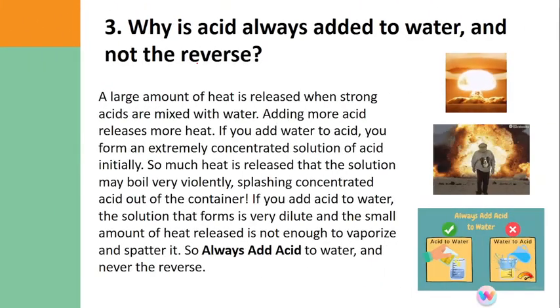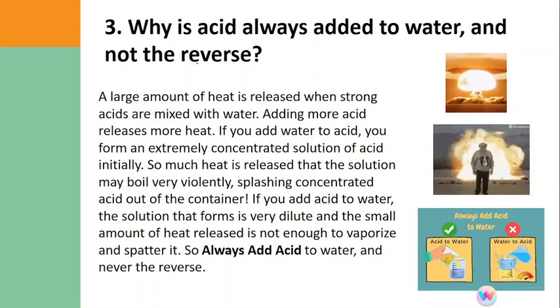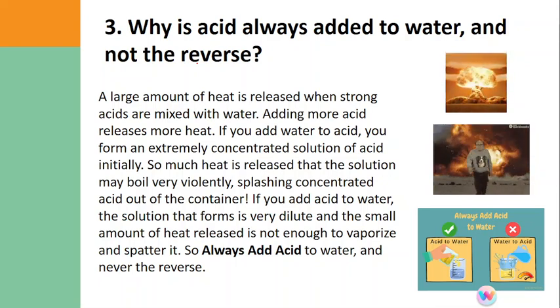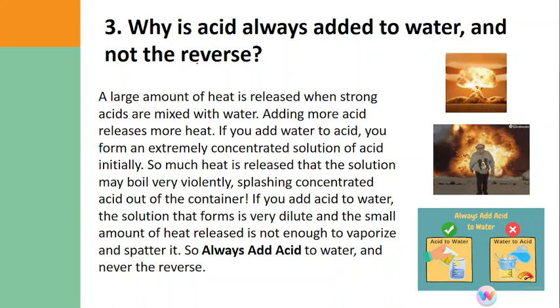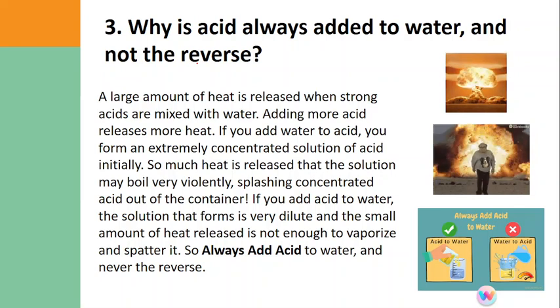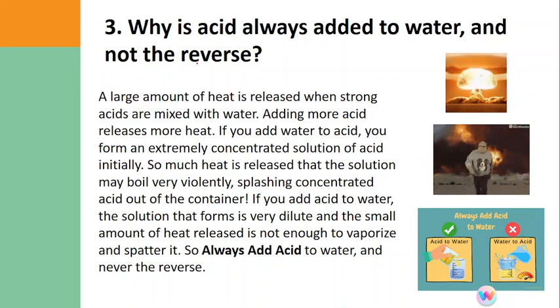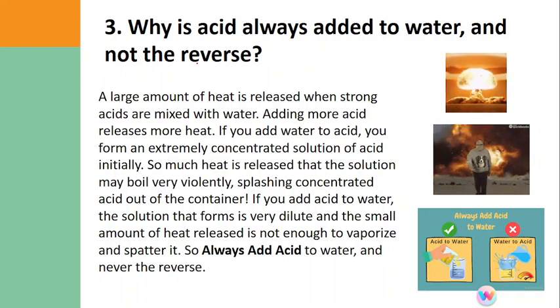And then lastly, why is acid always added to water and not the reverse? If you are confused about whether it should be water to acid or acid to water, remember our mnemonic: acid to water. Okay? Why is acid always added to water and not the reverse?